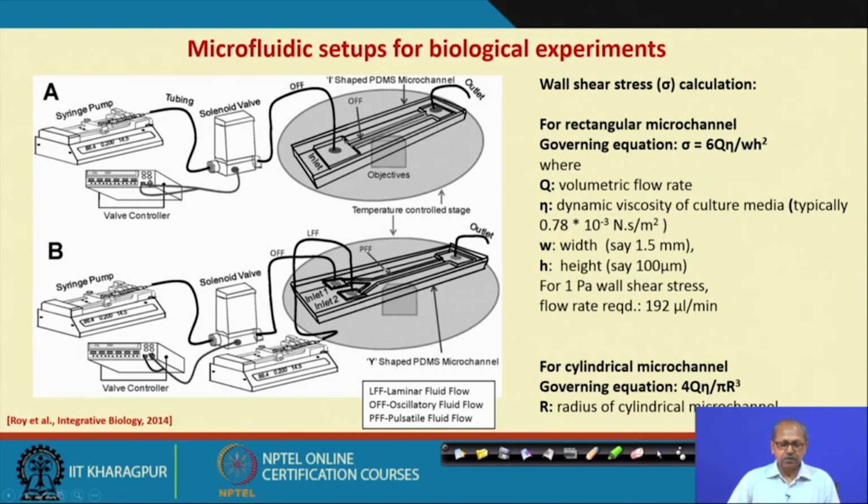For pulsatile fluid flow, we are using that Y-shaped channel. In one arm, it is directly connected with that syringe pump to form a steady or permanent fluid column inside that channel.